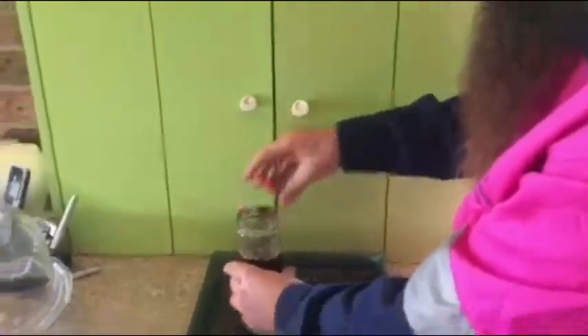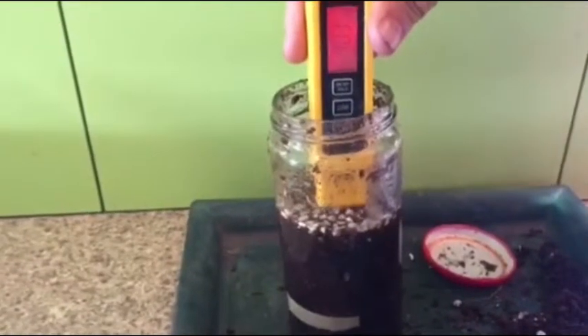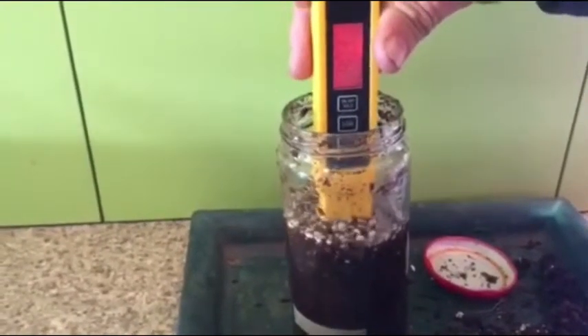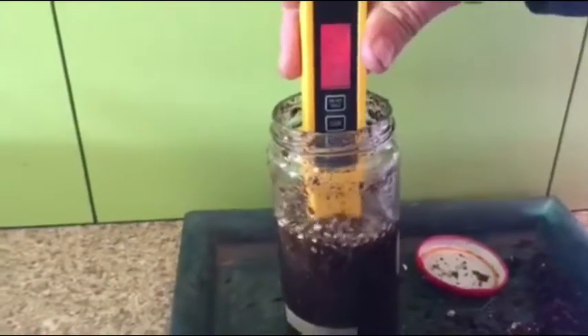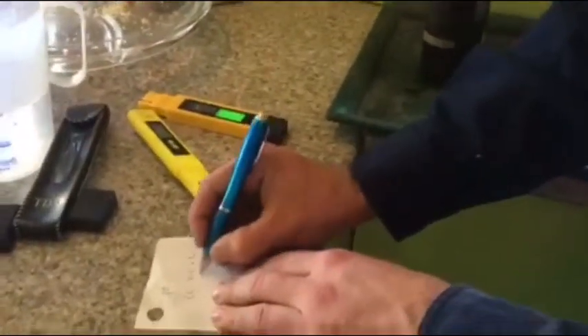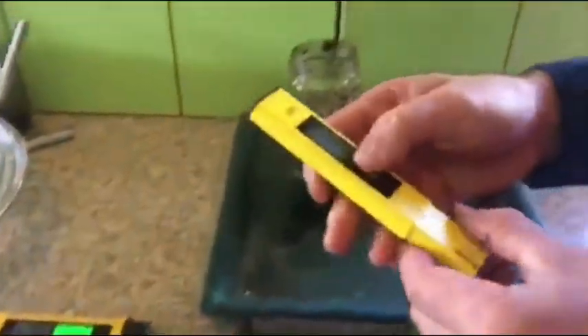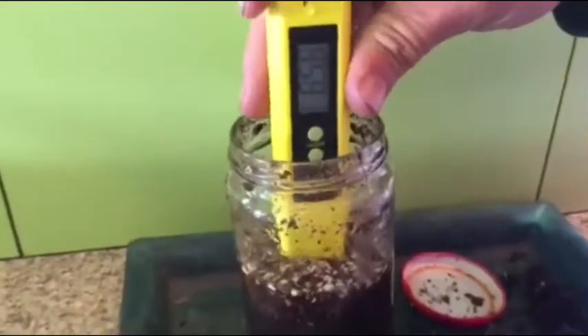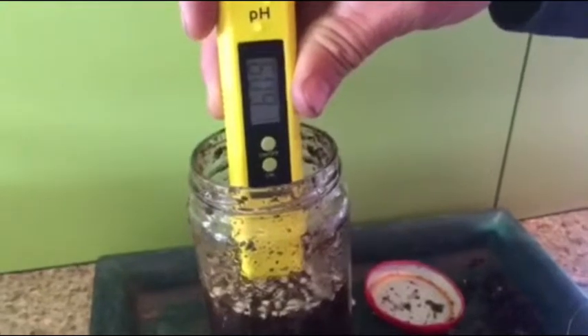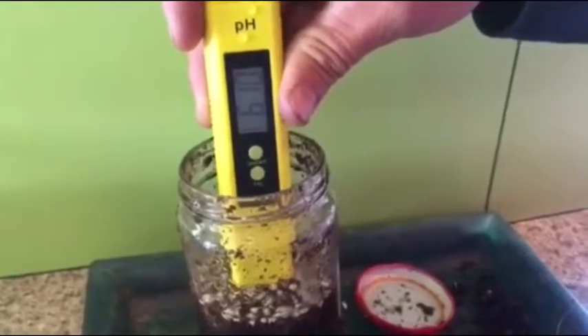Okay, moment of truth. Do the EC reading first. It peaked at 415, so we'll call that 415. That's 415 divided by 2, divided by 1000 — we'll work that out in a minute. And pH: let that settle down. We'll call that about 6.1. Those tests are done.